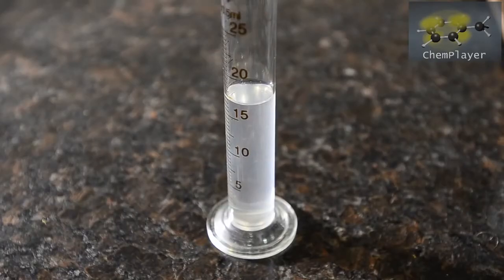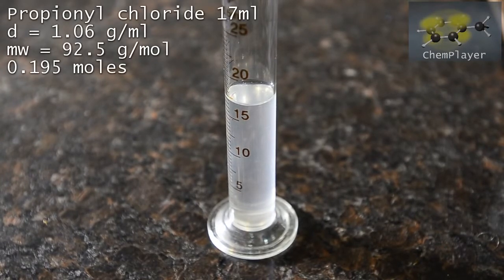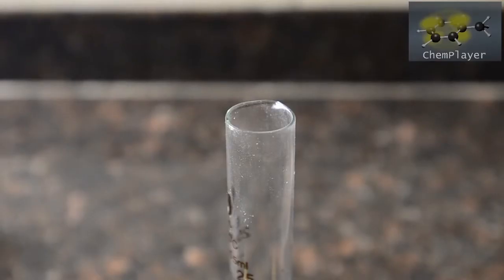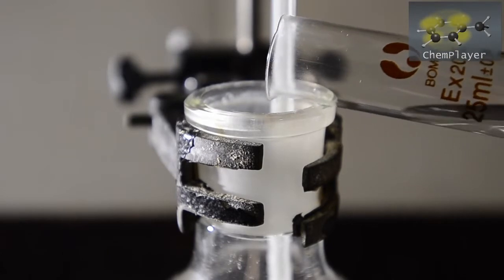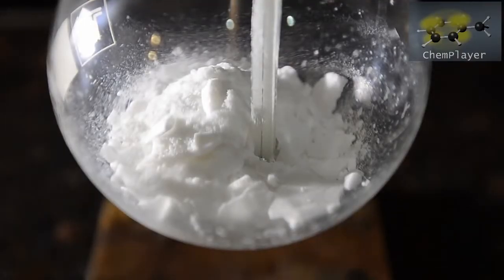Now we've measured out 17 ml of propionyl chloride. For some reason this has gone milky colored in storage, but it still fumes strongly in air and seems to be fairly pure. So we'll start off and add just a few ml of this to the flask containing the anhydrous sodium propionate. The temperature increase is rapid and dramatic. Just that tiny amount added has taken the temperature up to nearly 65 degrees C.